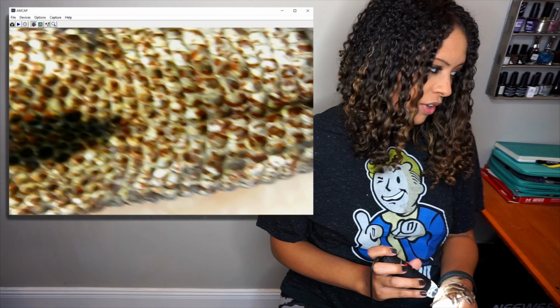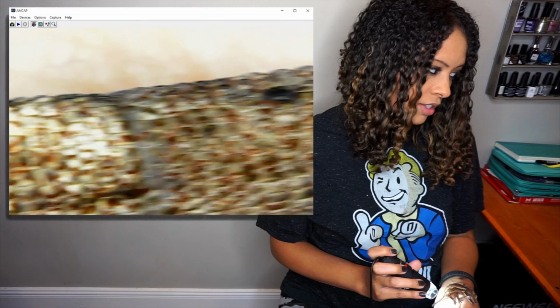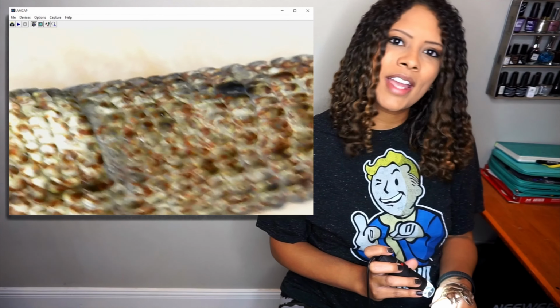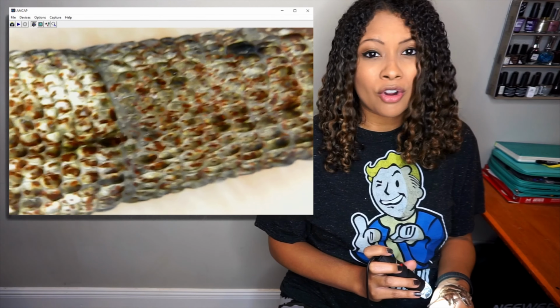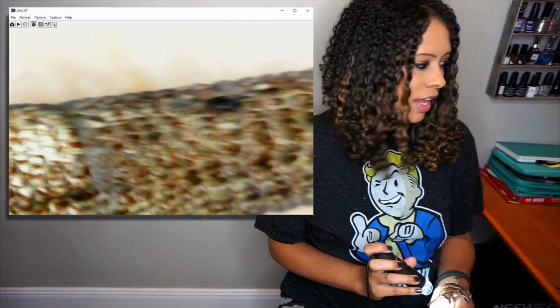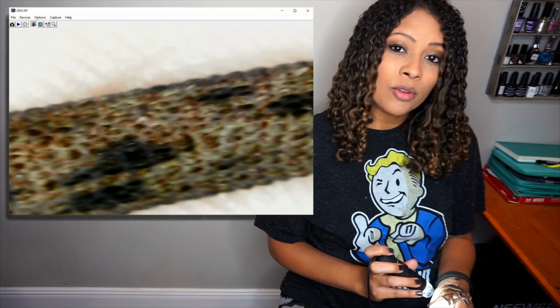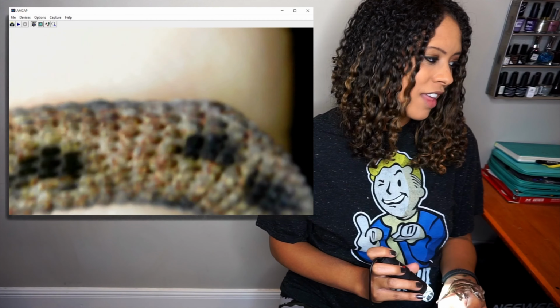And he also has a regrown tail, so you can see there's the base of his tail, and it goes down, and that's the regrown part. The colors are basically the same. I mean, me looking at it where I'm at now, I can see that his tail's been regrown because it's more of a darker brown color, and there's also that notch right there where his tail starts. I actually got him with a regrown tail, and he has a little kink in his regrown tail, so there that is right there. Under the microscope, he definitely looks like he's made of pebbles almost, I guess.